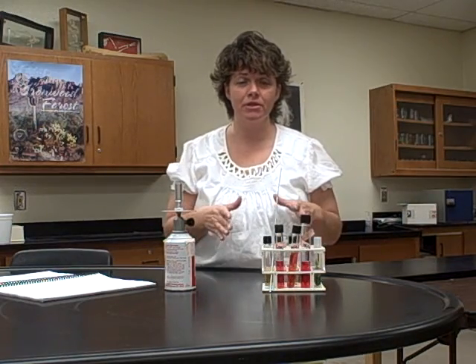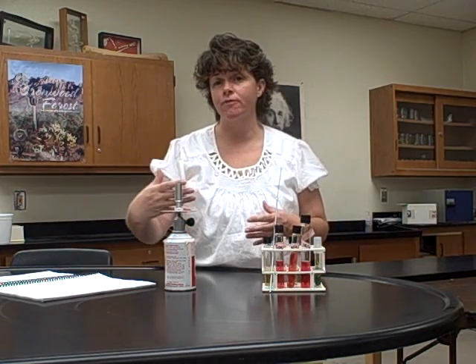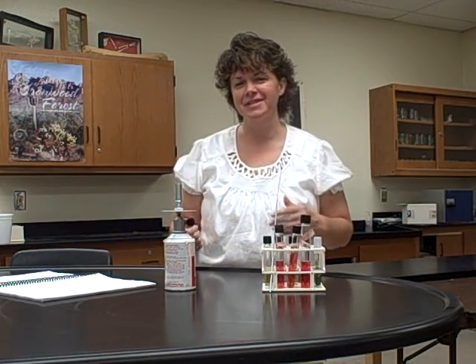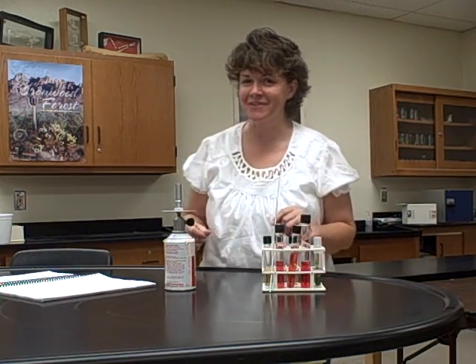So that's what we're going to be looking at today: whether or not they produce an acid through fermentation, or maybe they go through a different pathway and produce more of a neutral product. Based on that, we're going to see some color changes. This is kind of cool when you see the different color changes. Although your slides were very pretty last week, all the different colors.